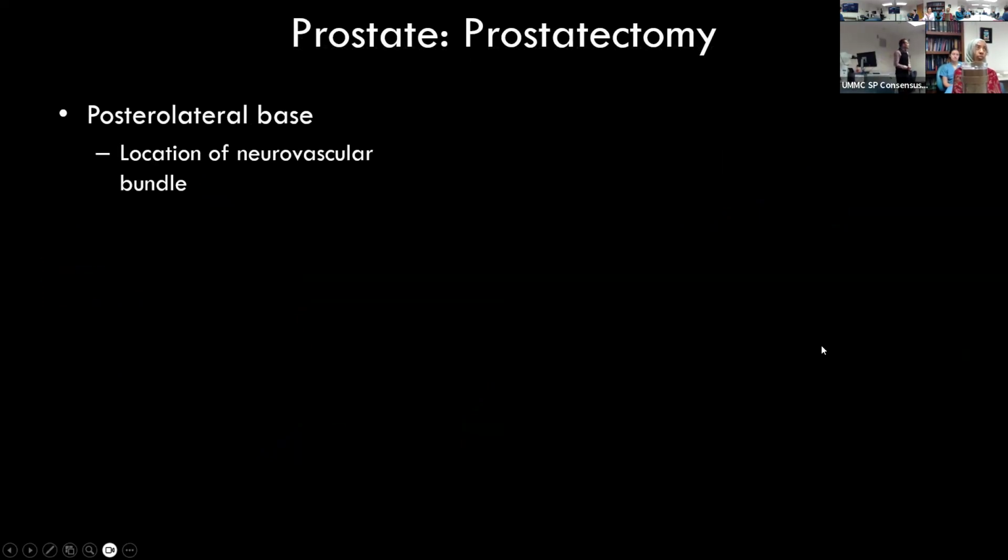And then what about the posterolateral base? Why is that important? That's important because that's where you have the neurovascular bundle on either side.